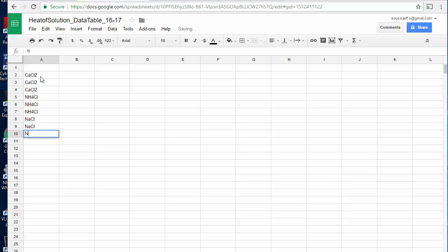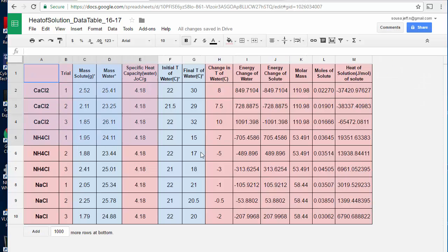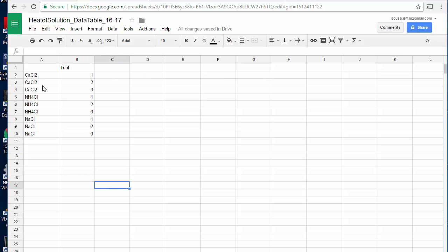There are some faster ways to do this, some shortcuts around Google and things like that. If you know how to use those, you're welcome to jump ahead. I'm doing this video a little more slowly just for people that aren't as familiar. What's next? I've got trial. So I'd come over and do trial. We did 3 trials of each, so I'm going to go 1, 2, 3, 1, 2, 3, 1, 2, 3. One thing you're probably noticing is that as I'm typing them in, it's not quite as aesthetically pleasing as my finished spreadsheet here. So I'll show you how to do some of those modifications.